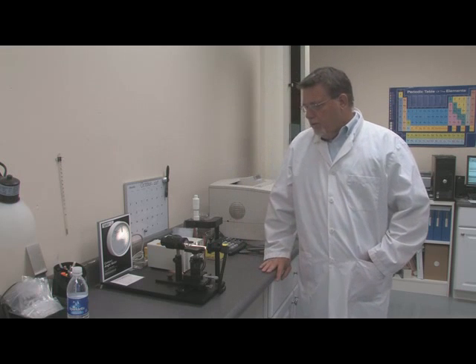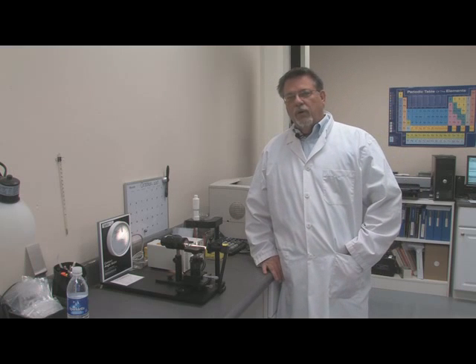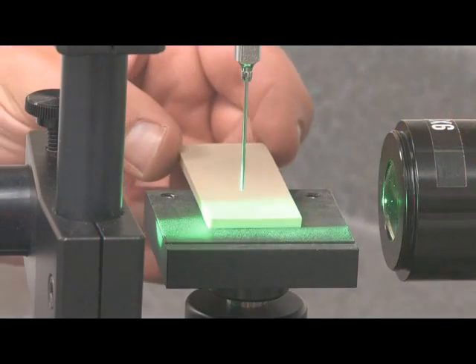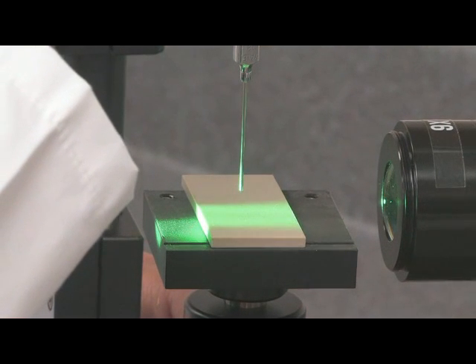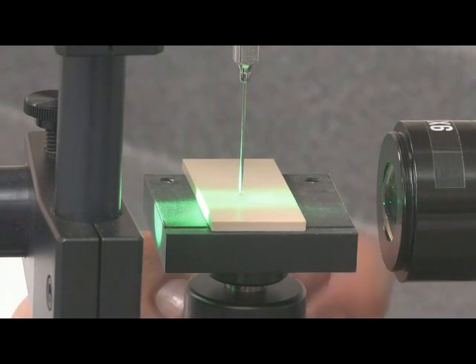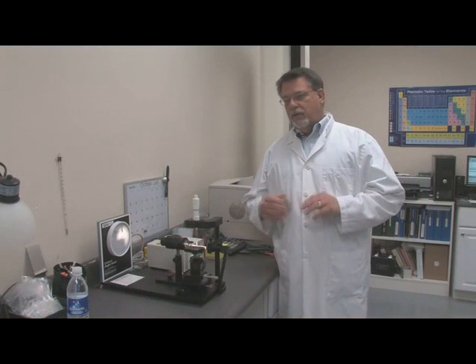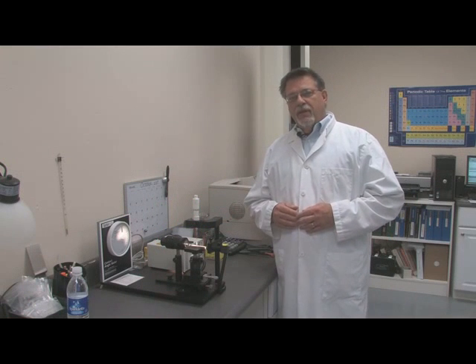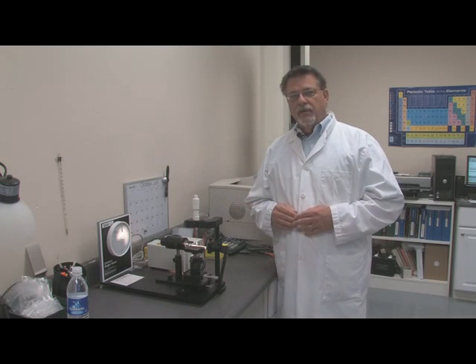First thing we're going to talk about is our Goniometer. Now, a Goniometer is a fancy name for a device to measure surface tension. And what we do with this device is that we look at materials before we treat them for enhancement, and then after. And what we're trying to do here is be sure that we're generating the right surface structure to meet whatever the customer's requirements are, whether that's hydrophobic or hydrophilic. This is the mechanism that we use to test it. And we do that by simply looking at the contact angle of that material.